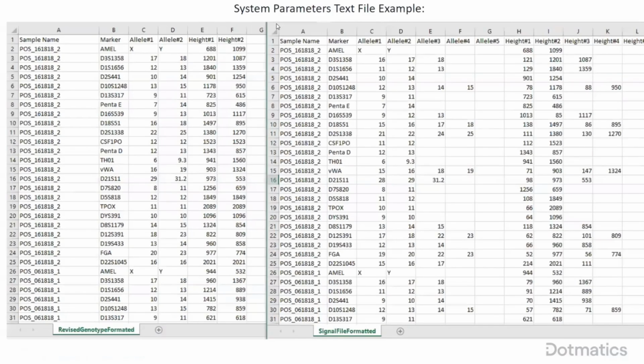Okay, so here's just an example of the file template. We've got the samples on the image on the left, and this is just the allele calls and their peak heights. So this is giving the information of what's typical peak height. And then these samples are also analyzed, including the stutter. And so here we've got all the allele calls. As you can see, it was a 17-18 with a 16 stutter, and 12-13 with the 11 stutter.